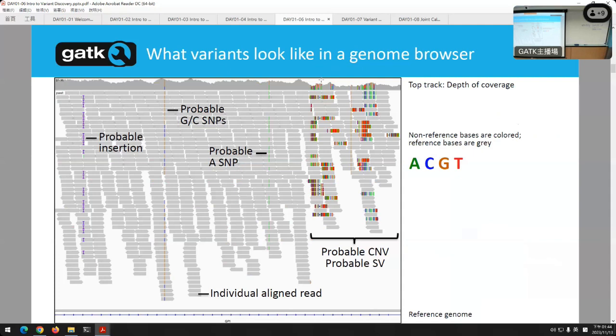So that's what it would look like when you have a heterozygous SNP. Heterozygous means your genotype is different: there's 1 C and 1 G, not 2 C's. Versus homozygous, which means both copies from your parents are the same allele, the same letter.